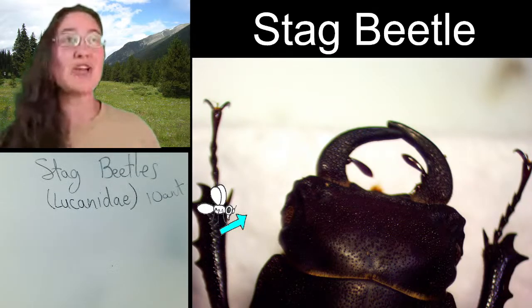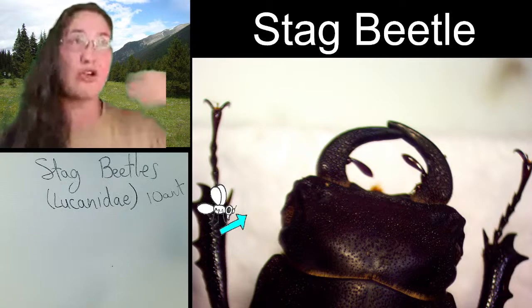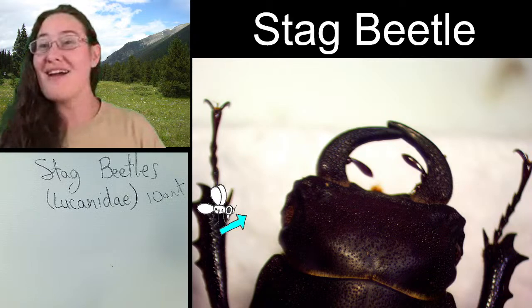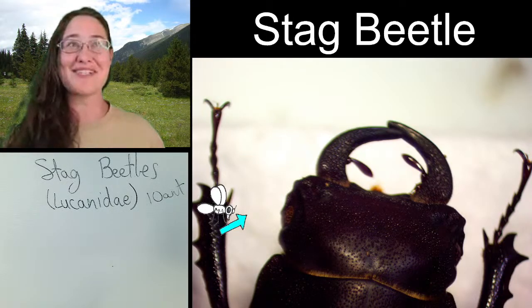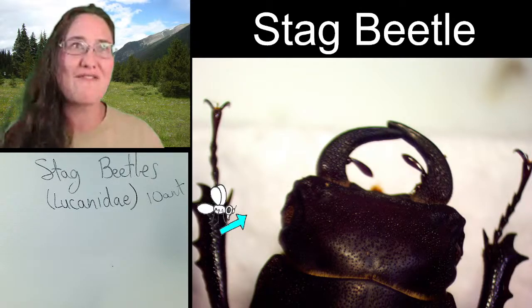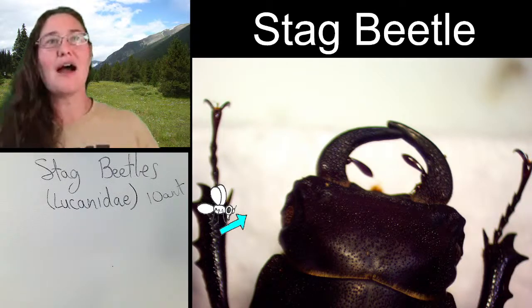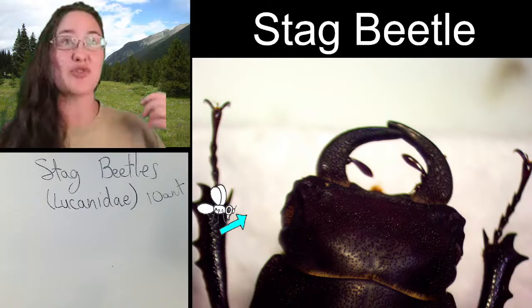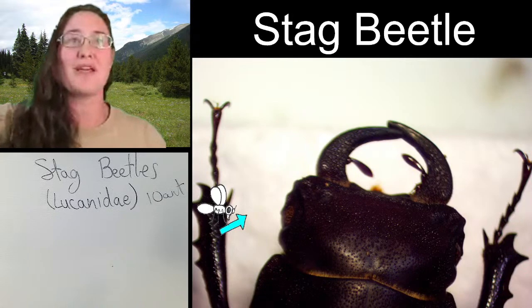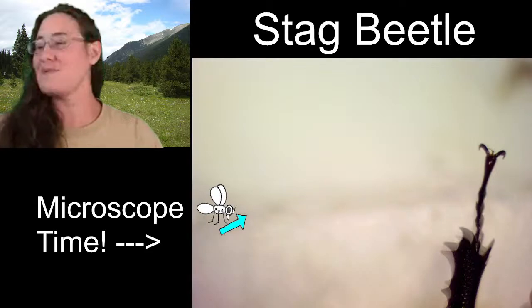It's awesome that we can actually sketch this beetle from a dorsal or top point of view. We're going to be starting our sketches really light, just as we always do. Our microscope is zoomed out all the way so we can determine the length of the mandibles in comparison to the head.